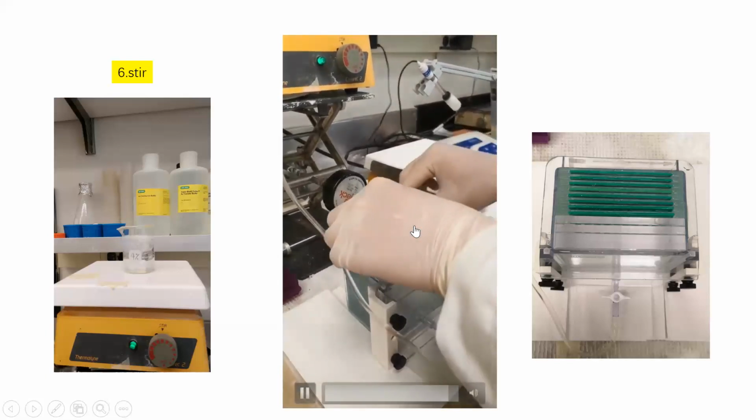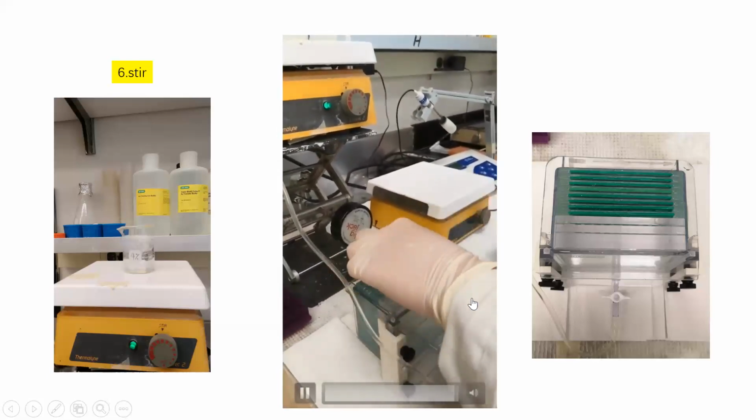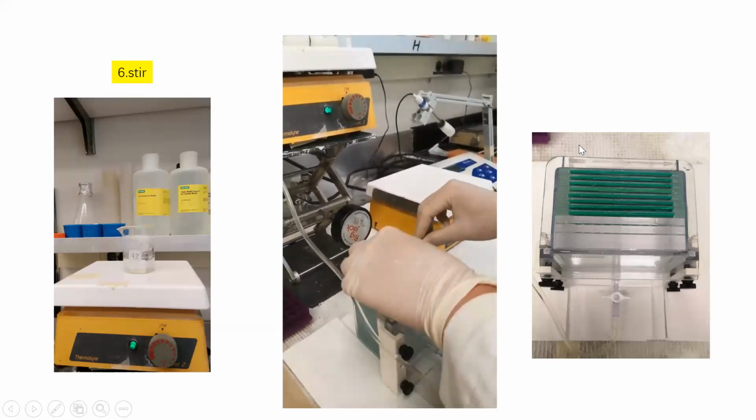And we will insert the comb here one by one. At last, it will look like this, and wait for maybe 30 minutes. It will coagulate and be ready to use.